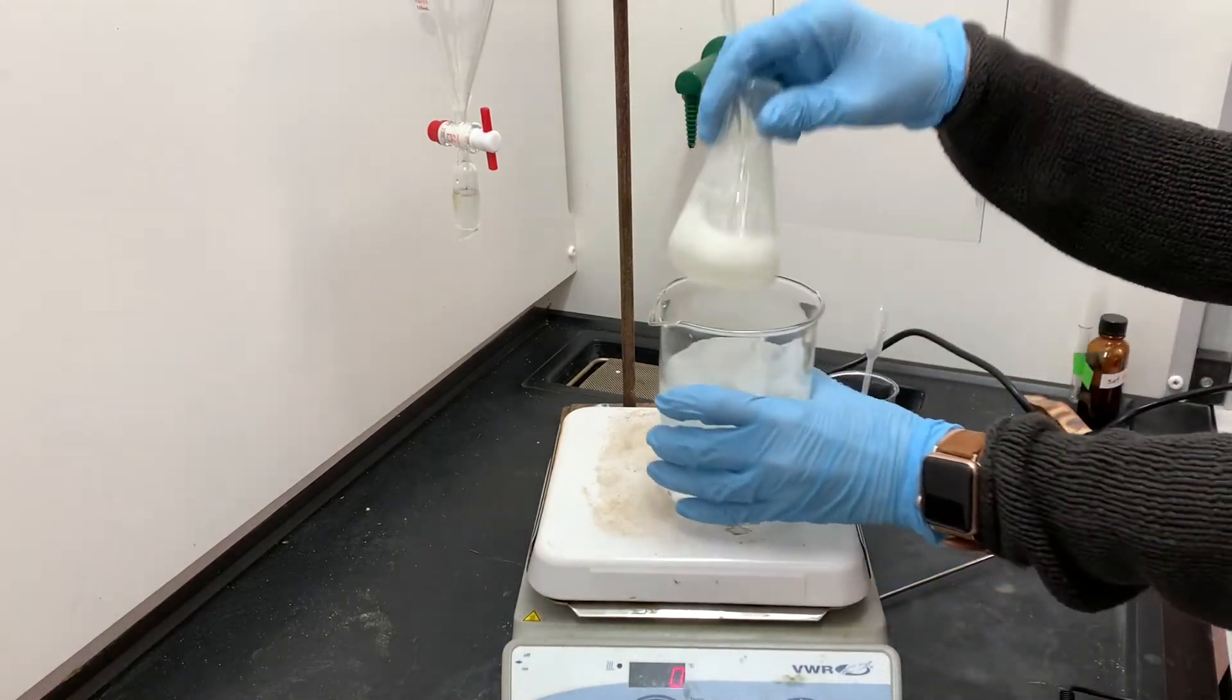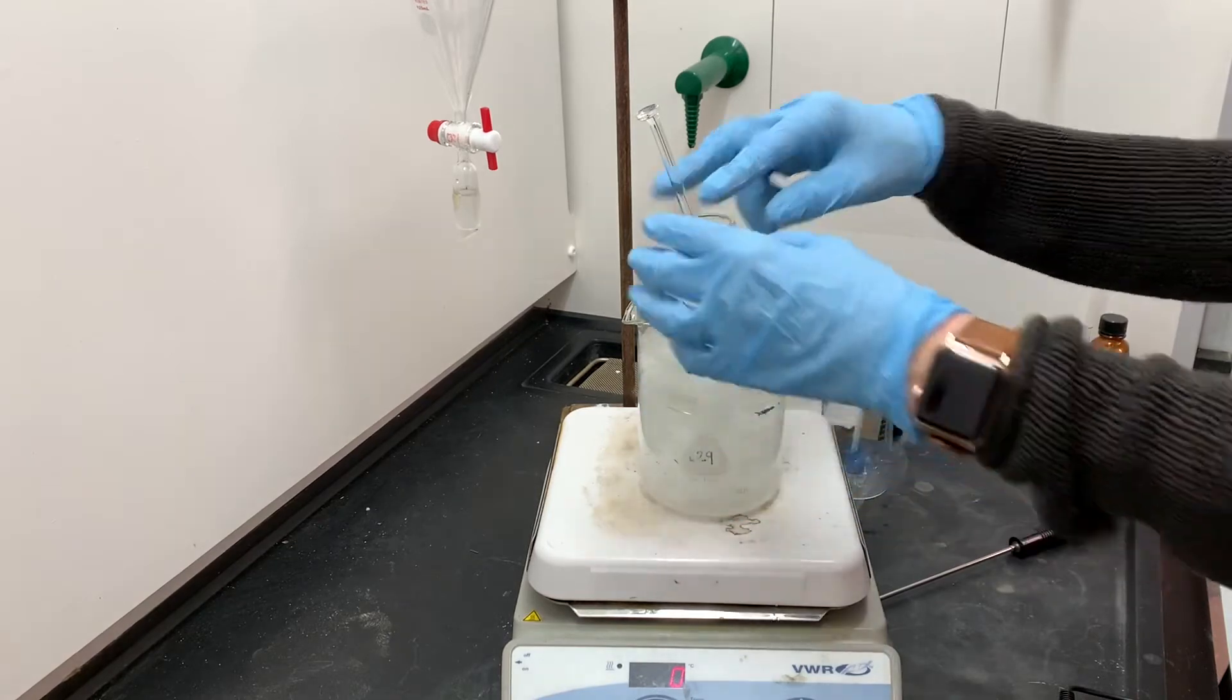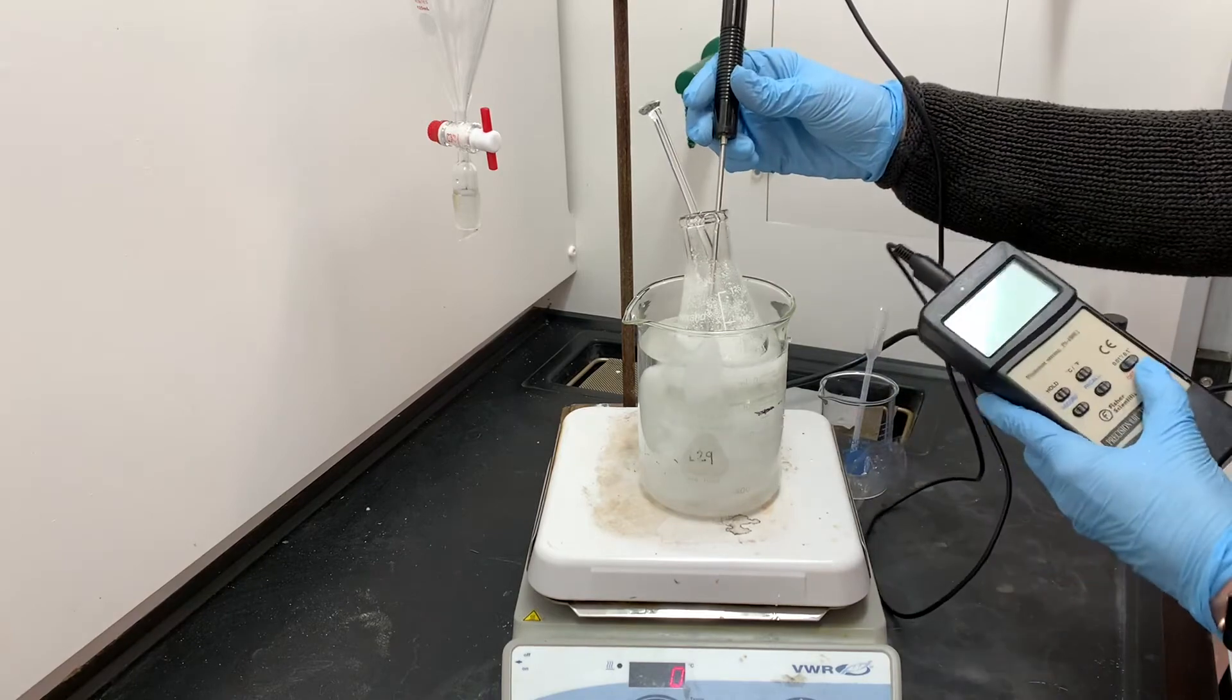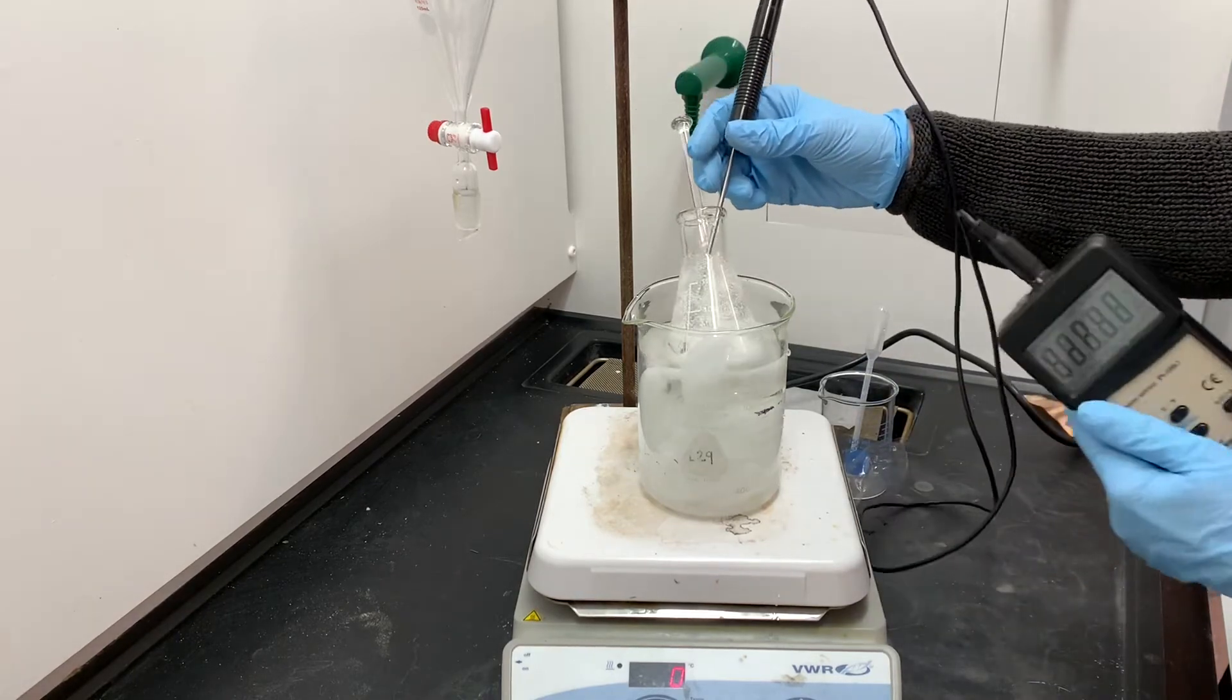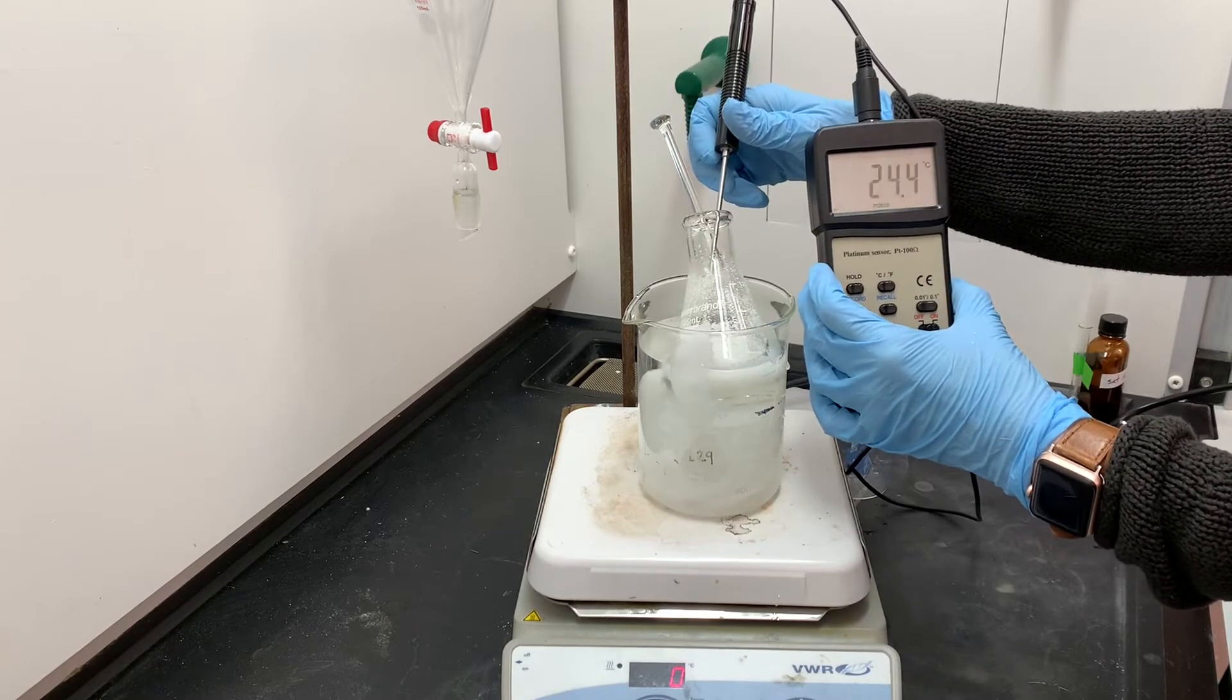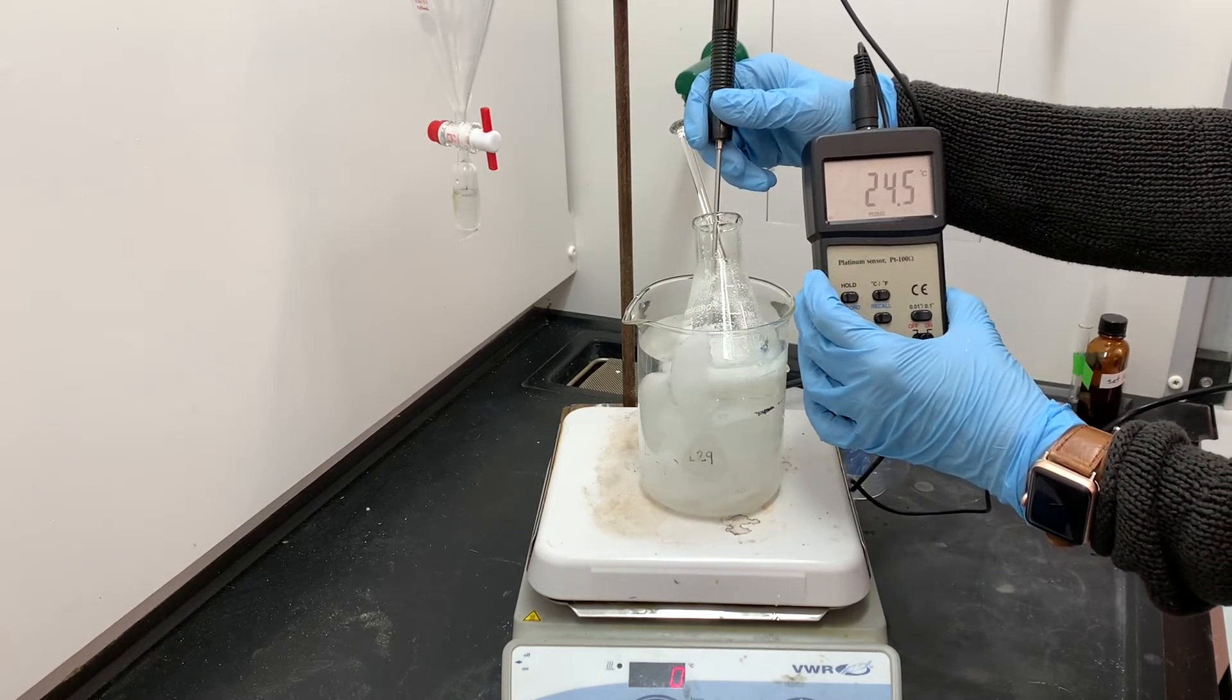All of the bleach has been neutralized, so we're going to put this solution on an ice water bath and let it finish crystallizing so that we can filter it out. The directions tell us that our solution, not the ice water bath, but the solution itself, needs to get all the way down to 5 degrees Celsius. So I'm going to be using a thermometer to monitor the temperature as this solution cools.